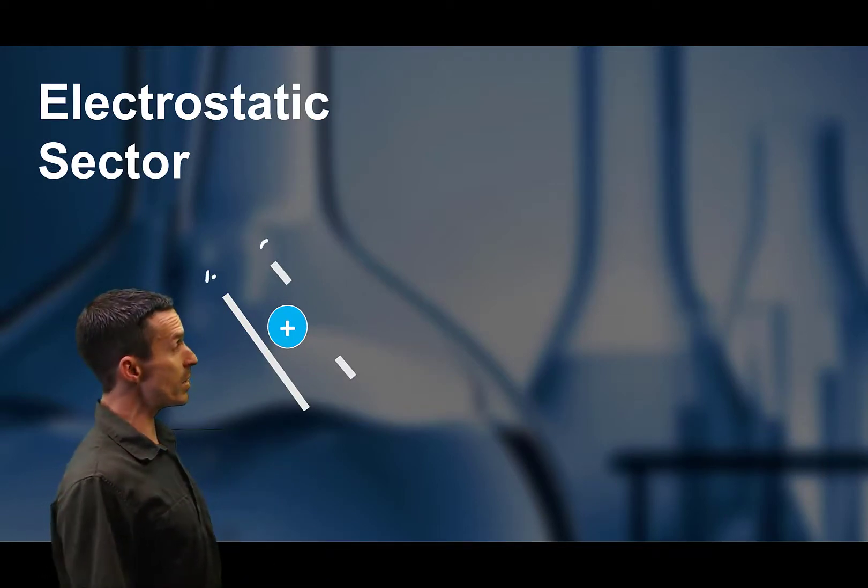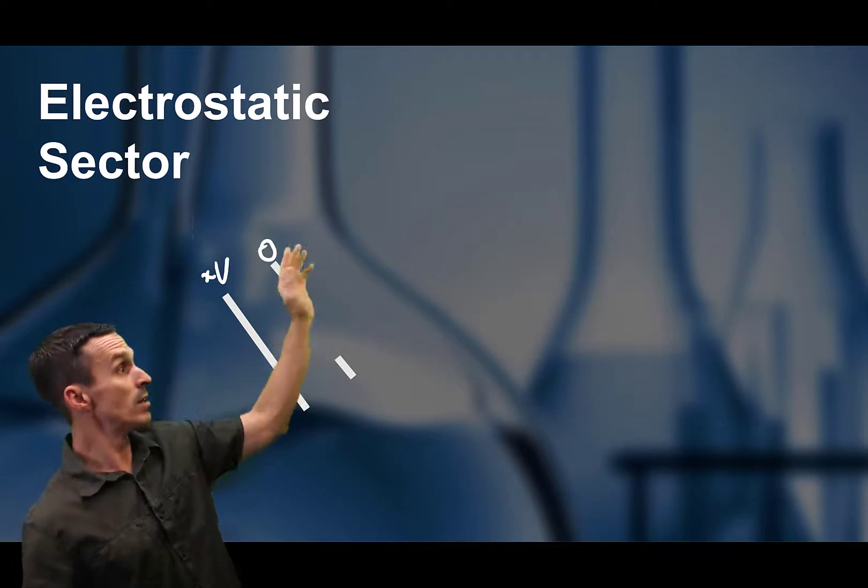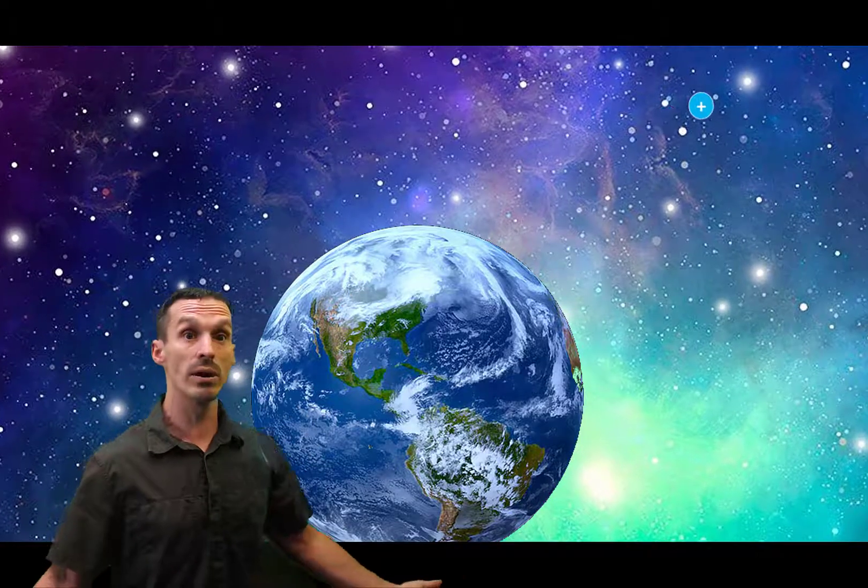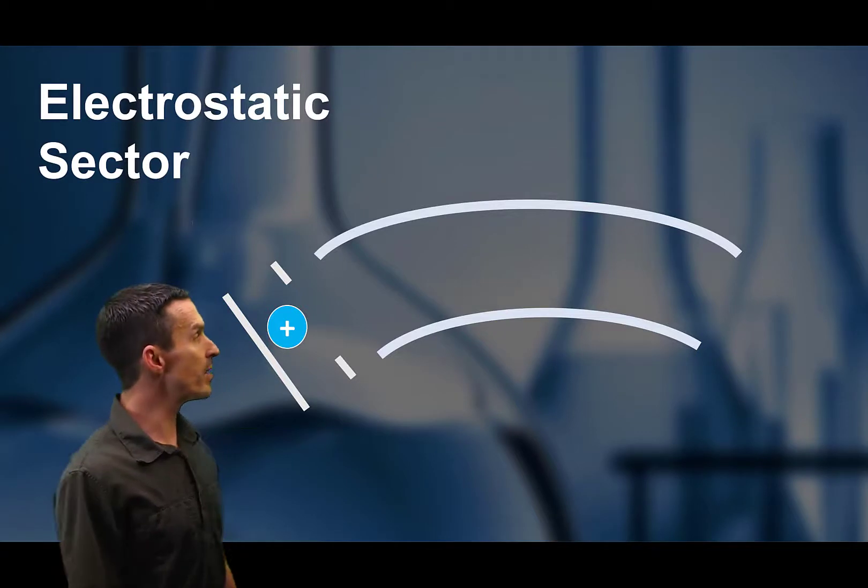So check out this configuration here, same voltage system. You turn the volts on, the ion just heads uphill. It just keeps going and going. It's sort of never going to stop, right? So let's just put something in the way.